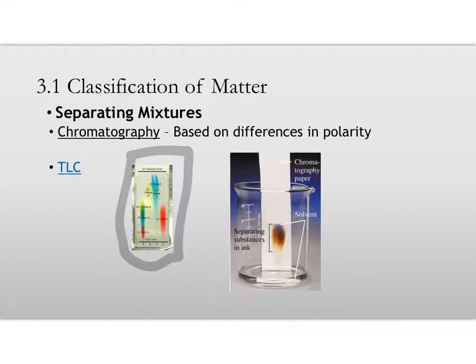In this case, the person has A, B, C, and D, different types of mixtures that they've spotted on that start line, and it's probably an ink.